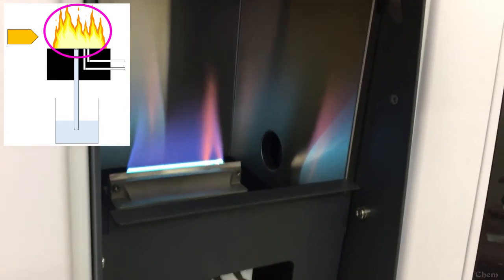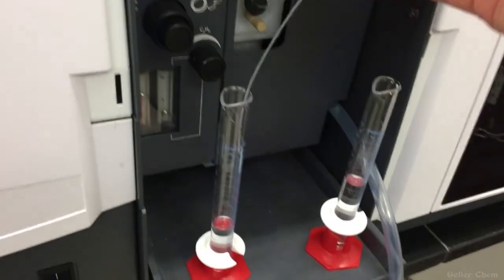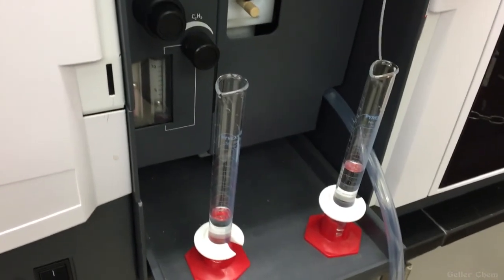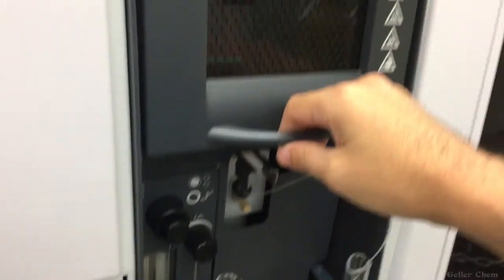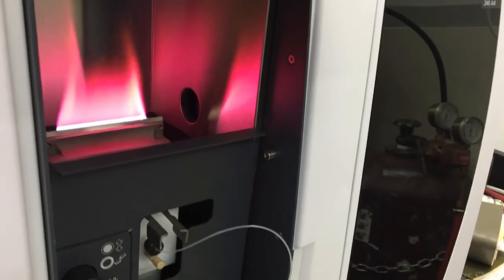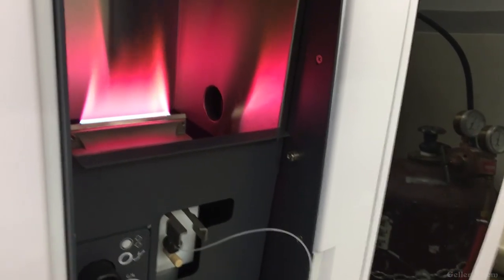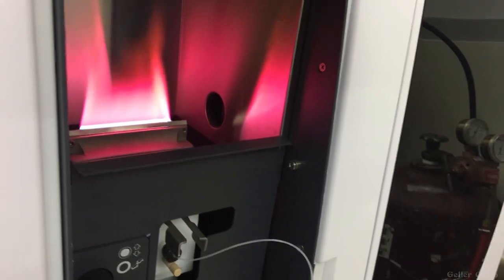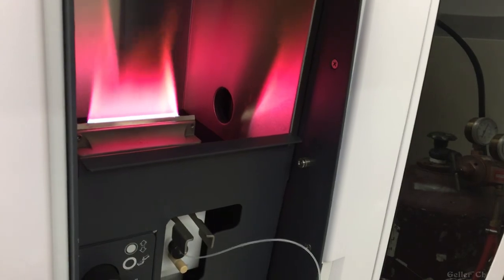Now watch what happens when I change the sample that we're currently aspirating. I'm going to put this tube into some lithium and water. We get a very different color, this very nice magenta. And we're going to get into what's happening here when we talk more about atomic emission spectroscopy. But for now, just remember it, I'm going to bring it back later.